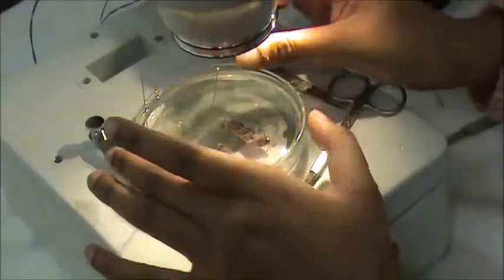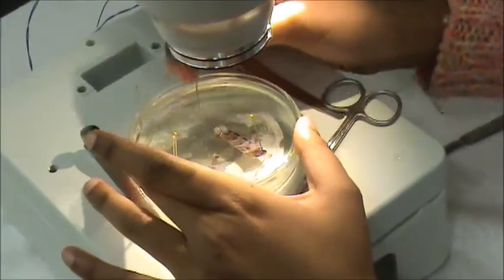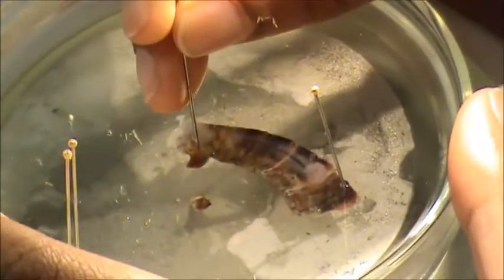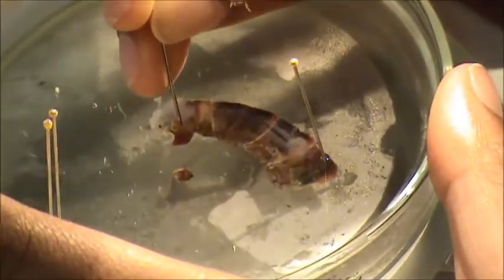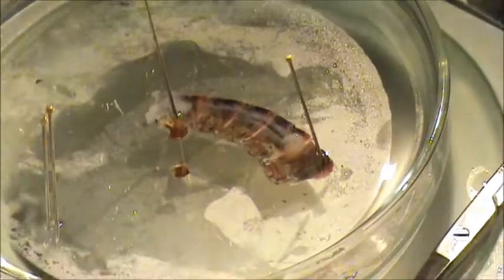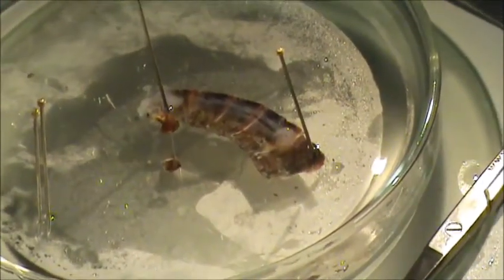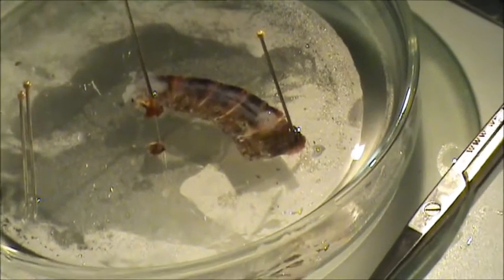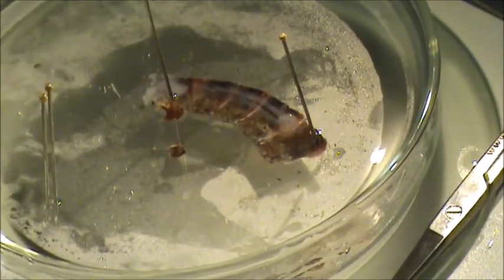So now what we're going to do is stretch this out. This is going to take some kind of a U shape, kind of like this. Because we've stretched it out and the muscles are nice and tight, when we stimulate it, the muscles aren't going to want to pop out the intracellular electrode.